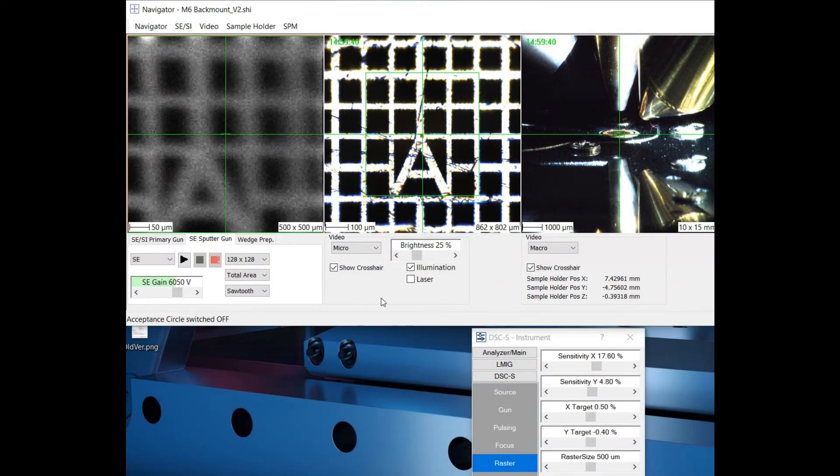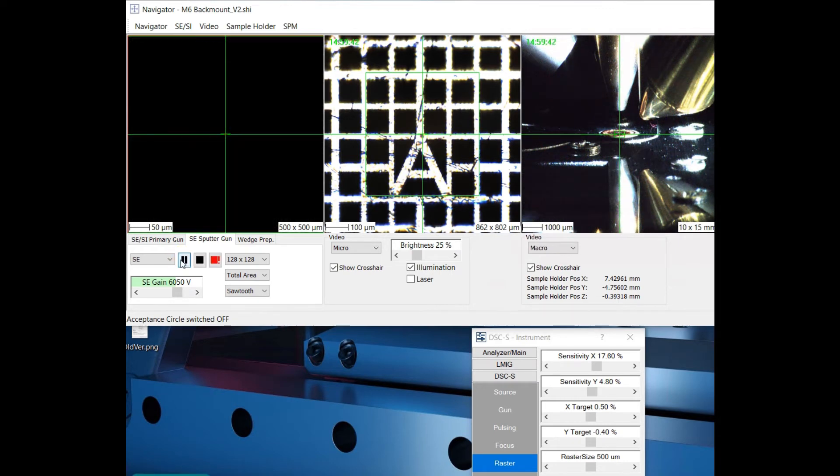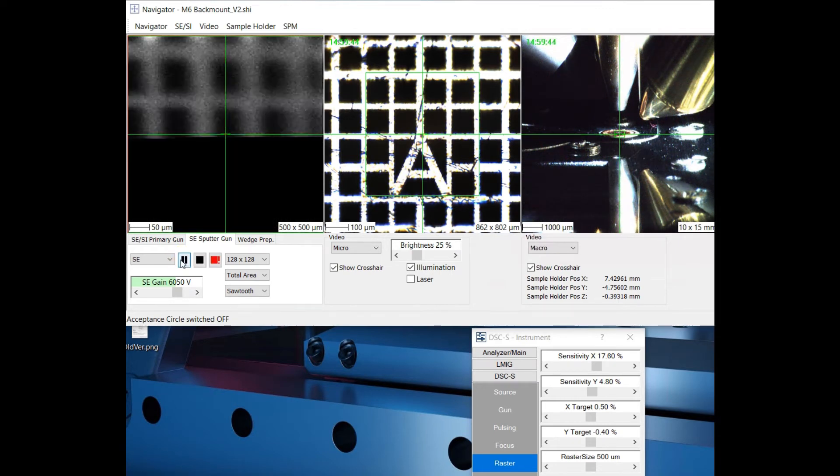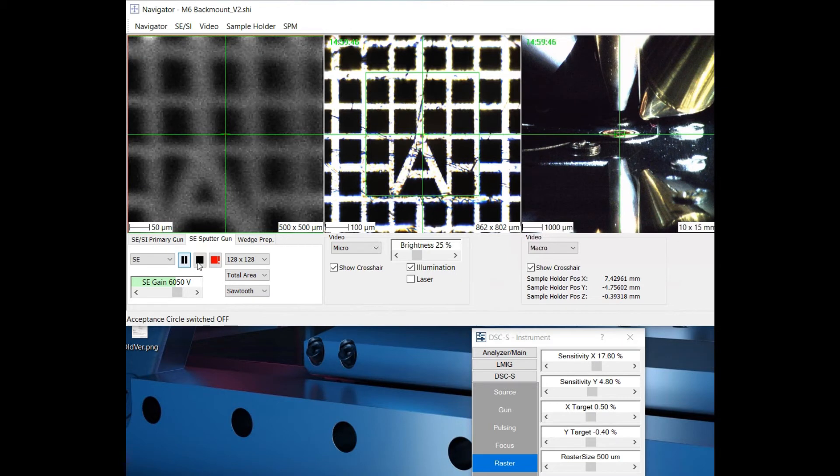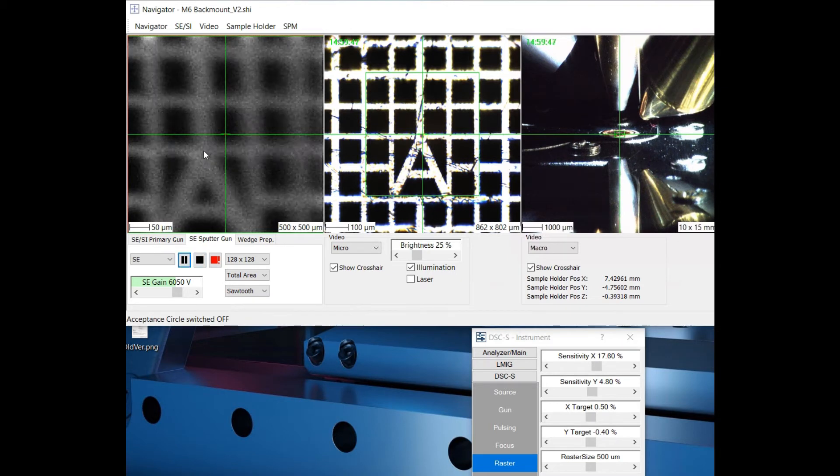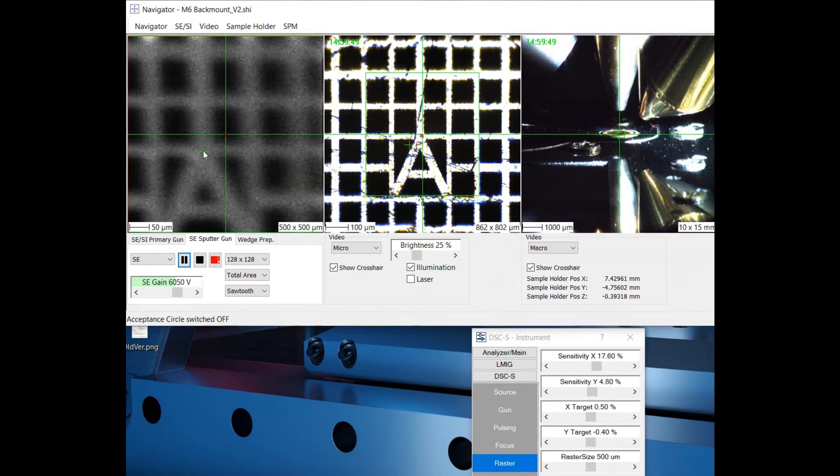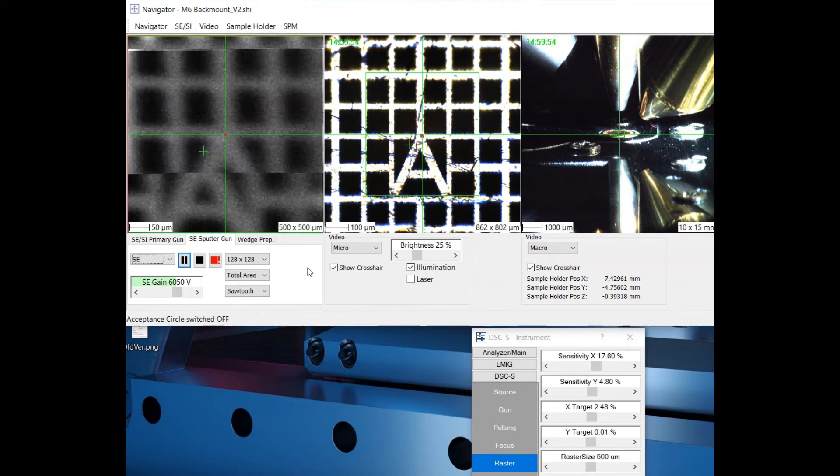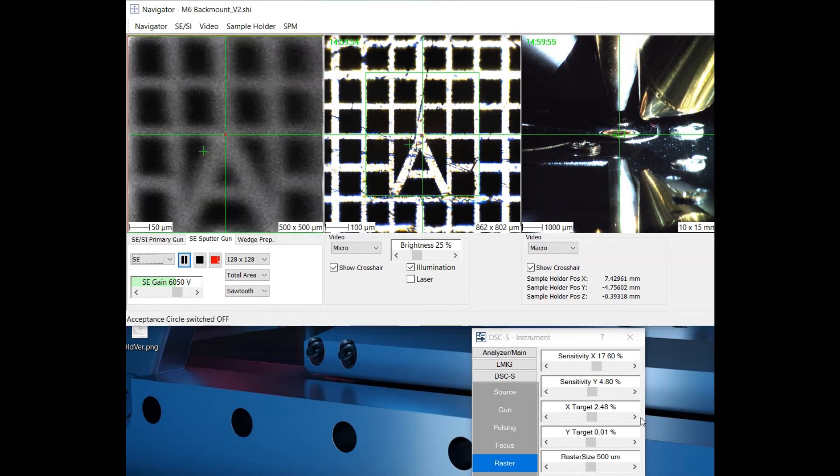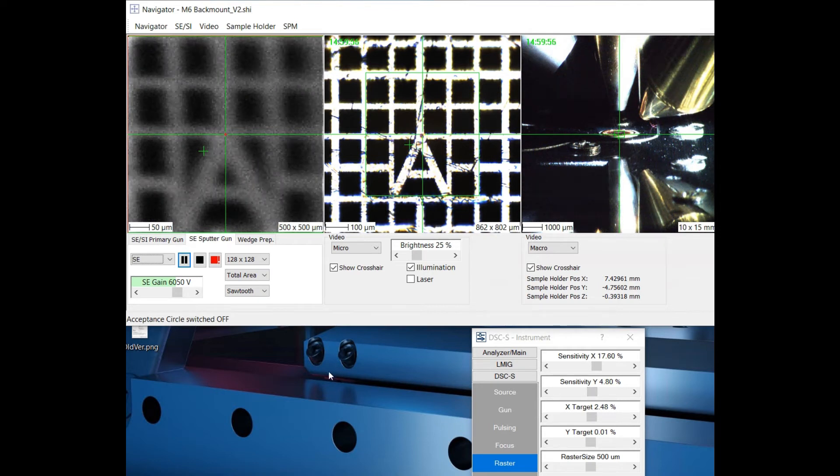You can now easily align your sputter crater to the analysis position in the navigator. Drive to the grid position and make sure you are in the correct height. Start an SE acquisition with the sputter gun. Left mouse click on the top of the A and select Center sputter raster around cursor in the navigator menu.